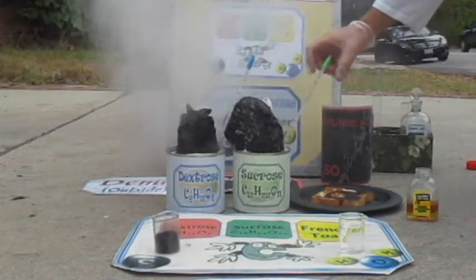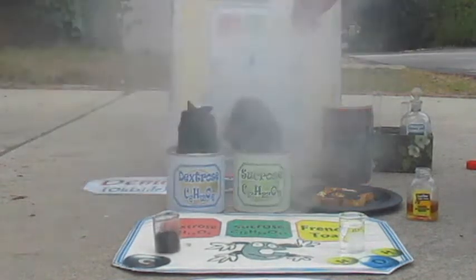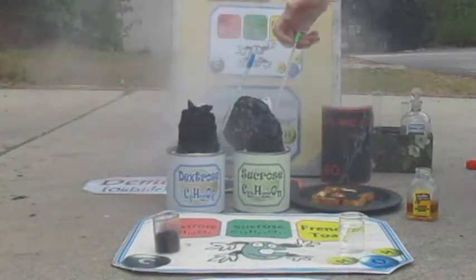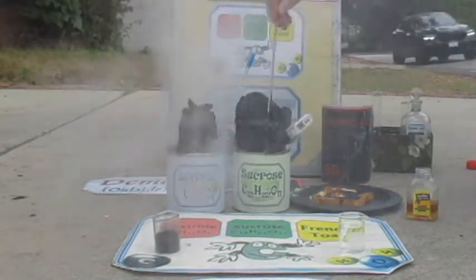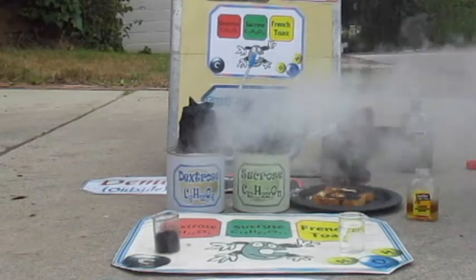It's tricky. Oh wow, this was over 90. Look at this, it's way up near the top. 100, 110, uh-oh. I better pull it out. Look at that. So, I'm gonna go on the other side.